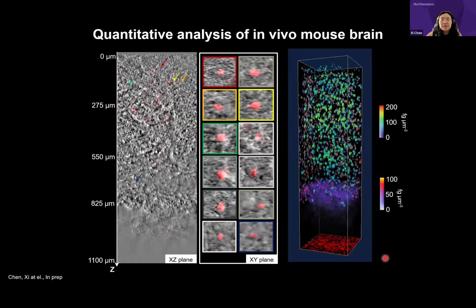And another benefit of CQPI is that because it is a quantitative phase information, it does not depend on the imaging parameters that you're using. For example, if you enhance the light or increase the gain of the detector, the quantitative phase information will not change. With that, you can use this information to analyze your biological samples in a meaningful, long-term way. You can look at the dry mass distribution at different time points and look at the dry mass distribution of the structure that you're interested in.